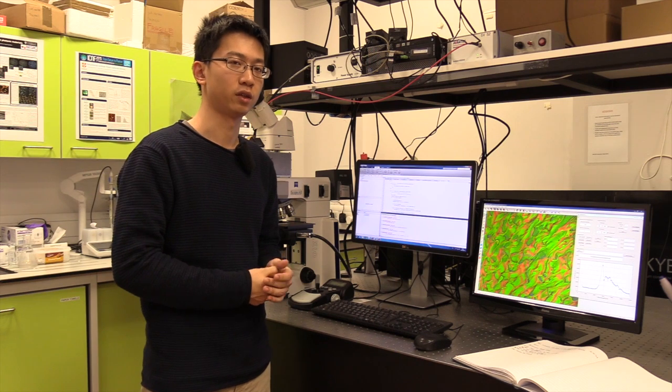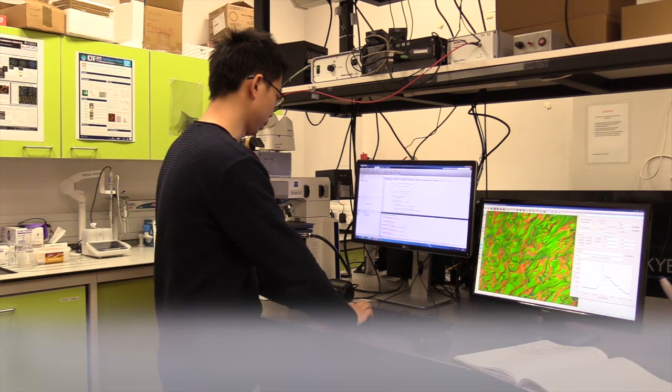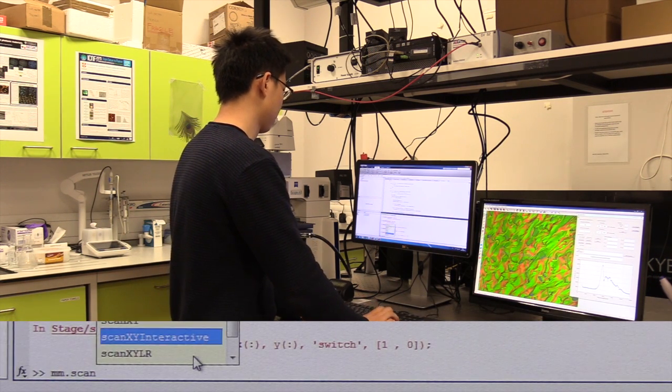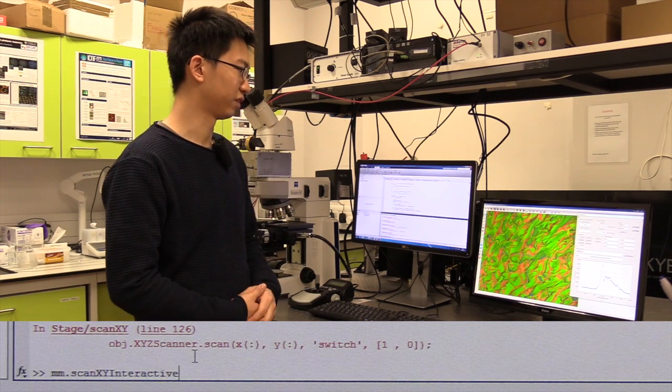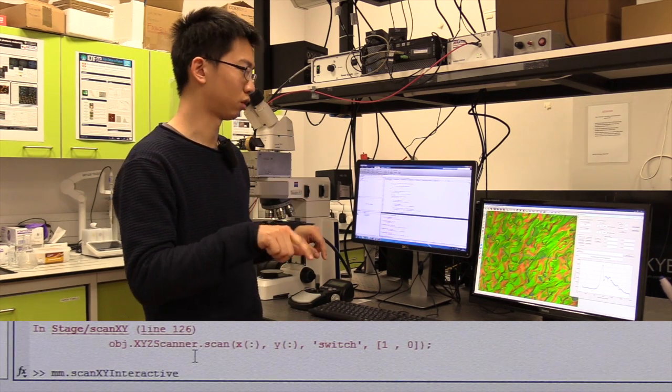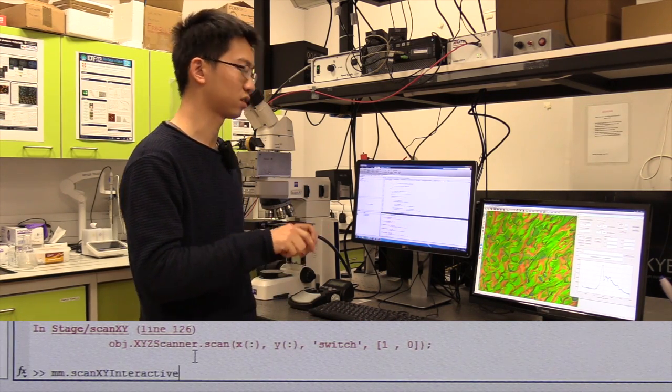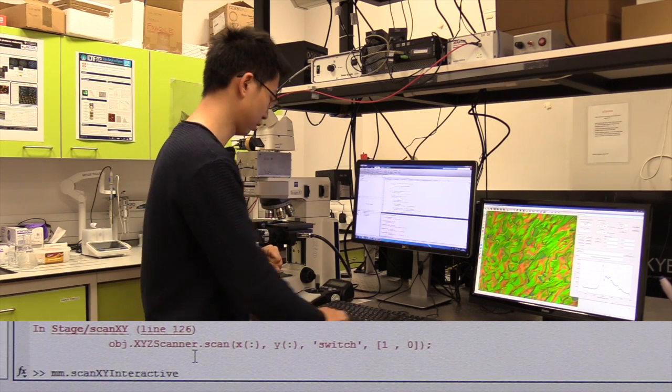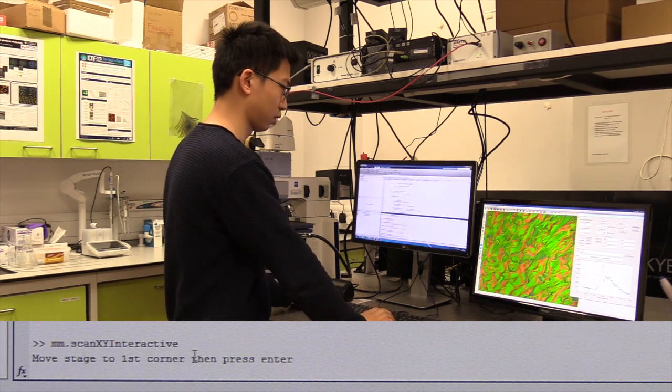Another very useful function is called scan XY interactive. As the name suggests, it allows you to scan interactively. That means you will be given a chance to define your region of interest and scan inside this region. For example, I want to scan a square around here.